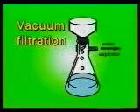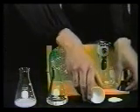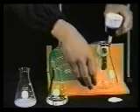Now that the crystals have formed, they need to be collected and dried in order to determine the yield from the crystallization and to analyze the purity. The separation of crystals from the supernatant liquid is best achieved by vacuum filtration, which has the added advantage of drying the crystals. In the apparatus shown here, vacuum is applied to the filter flask through a water trap.